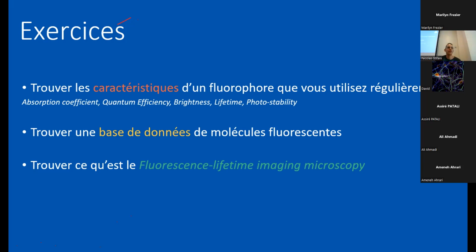I don't have your name, but Gilles? Julien, what do you use for fluorescence? FM464 and FITC. FITC, FM464.